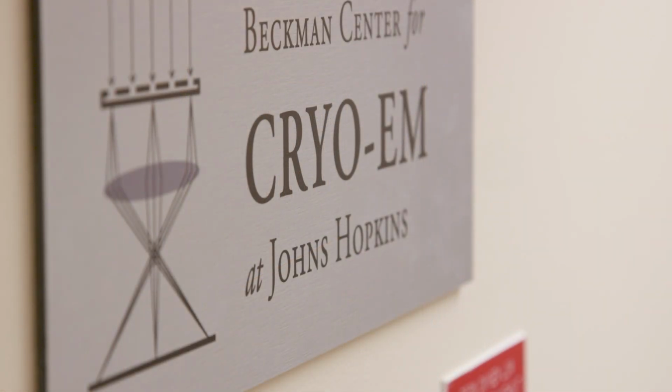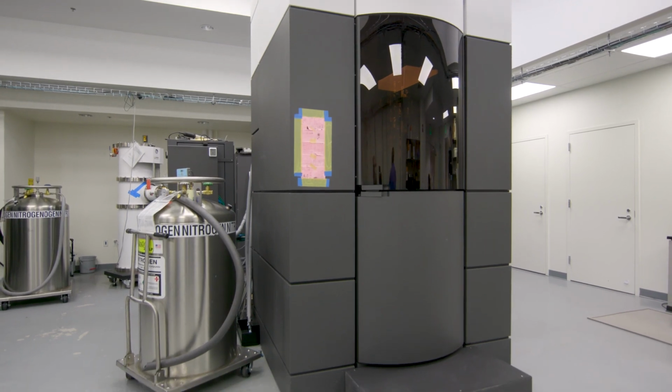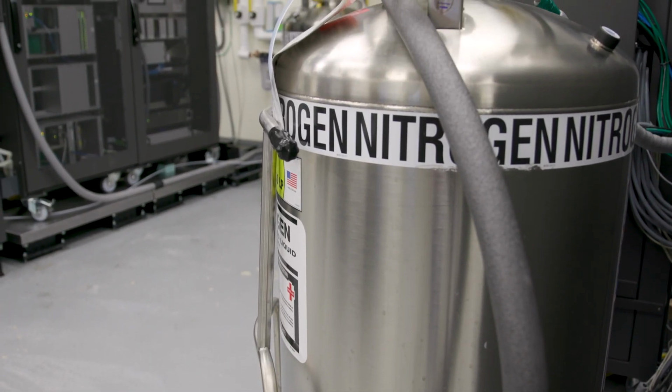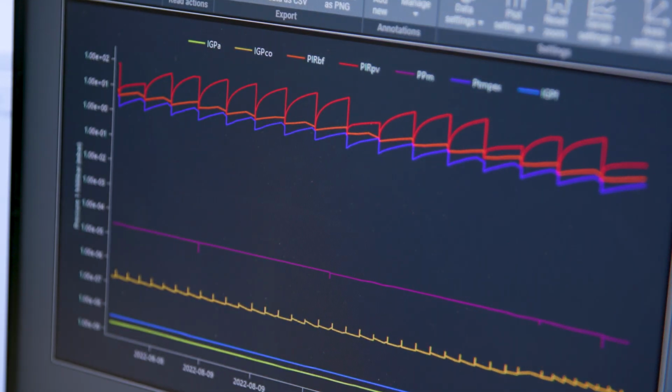The Beckman Foundation has a legacy of supporting science broadly, both in terms of young investigator science, but also in terms of instrumentation and instrumentation development. That type of support is really critical in the sciences. As we move through time and instrumentation becomes more complex, it also becomes that much more expensive. And so securing large amounts of funds to be able to acquire instrumentation, to be able to use it, maintain it, is quite a challenge.